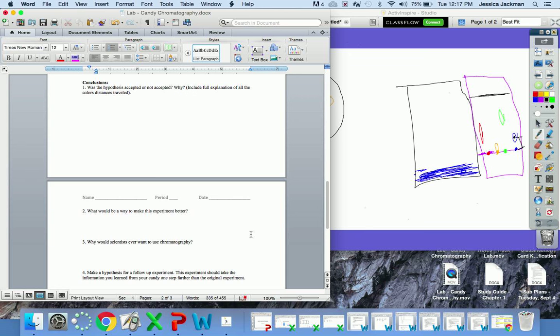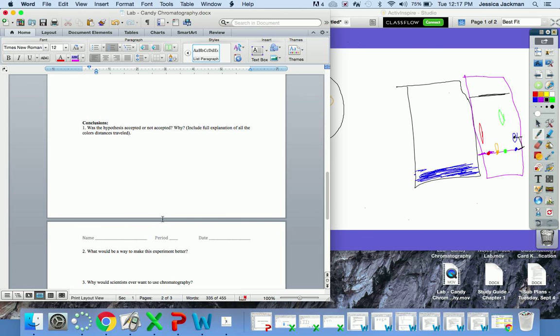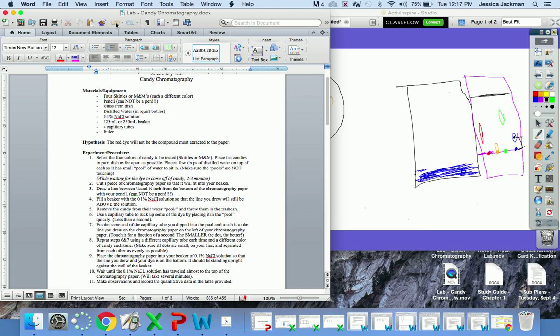Once you have that data recorded for each one, remember, center of the dot all the way to the line, you're going to go ahead and answer these 4 questions about it, and that'll be all. You are going to have those 4 questions for your lab due tomorrow. The rest of your lab hopefully shouldn't take too long. I'll be interested to see what your papers look like, since I'm not here to help you through it, because a lot of times 2 or 3 groups have to restart every time, so we'll see how it works out. But good luck, have some fun.